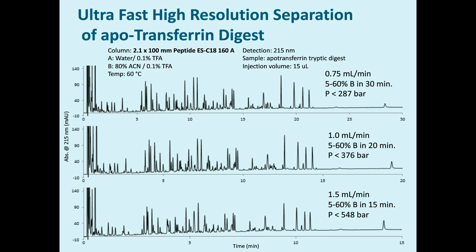So I put this up to remind people that when you're using superficially porous particulate materials, one of the reasons for their design is to please go ahead and try a faster separation. In many cases, you'll be pleasantly surprised that you lose very little in terms of resolution.